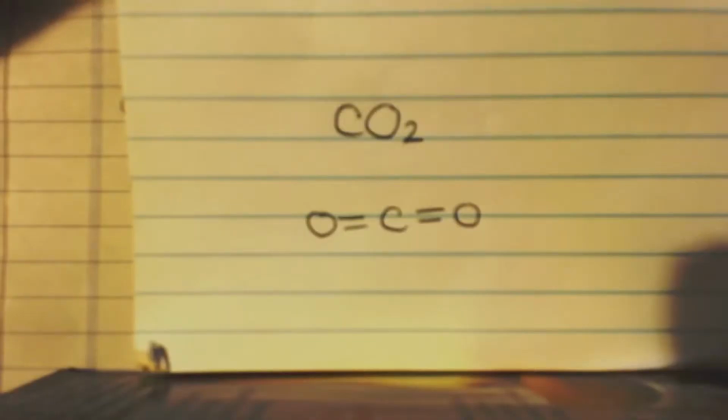In the example I'm going to show you here in a second, I have calcium hydroxide in the liquid. I can't show you me making carbon dioxide because it's a gas, you can't see it. So this way, visually you can see that it's reacting with the hydroxide to make a carbonate that's insoluble. And you can see that I'm actually making it.